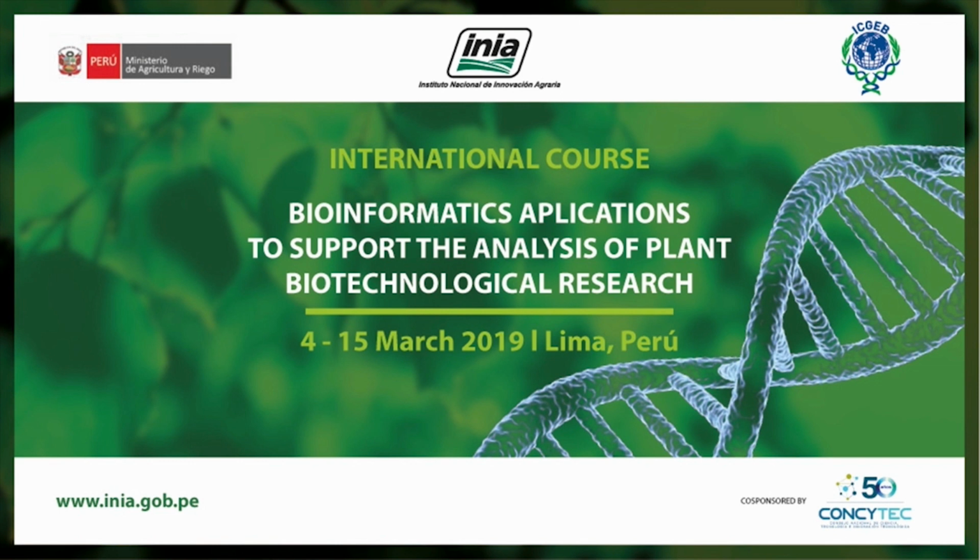So this algorithm is called CLUSTAL. If you've tried once or twice, if you go on the internet, you Google CLUSTAL, you will see that you have a very common page where you can just run multiple sequence alignment online and get your alignments in whichever format you want, because there are many formats to represent an alignment, and then you can use that alignment for several things.